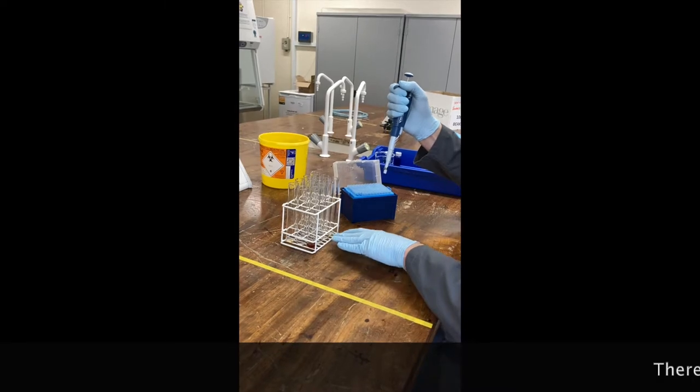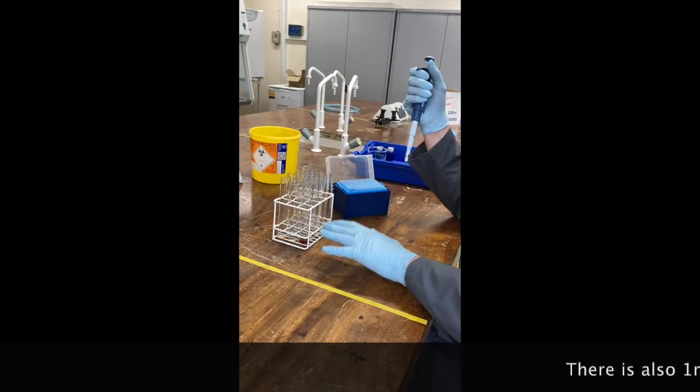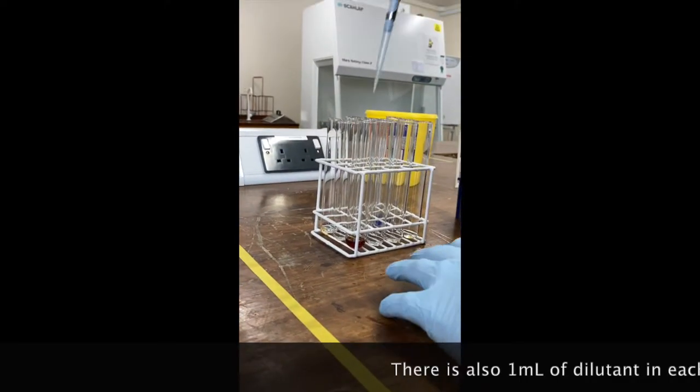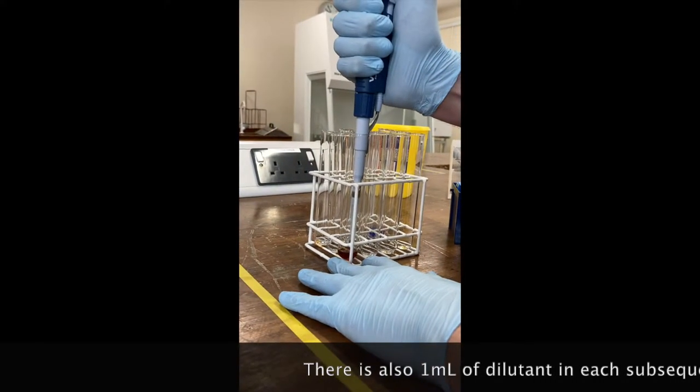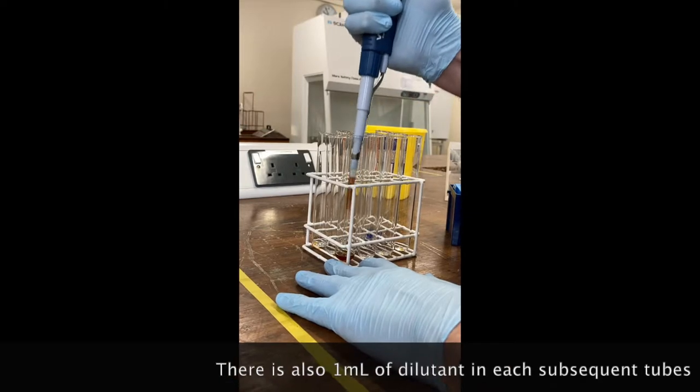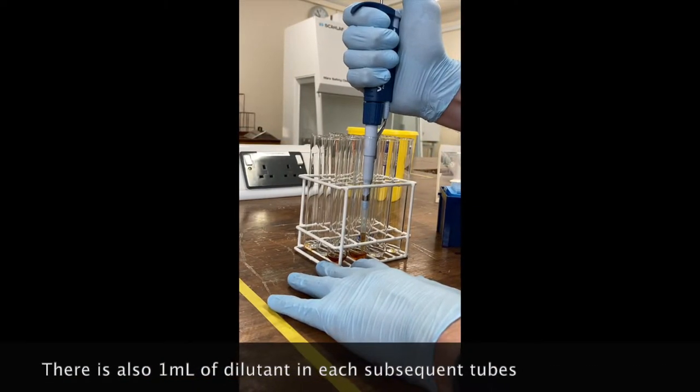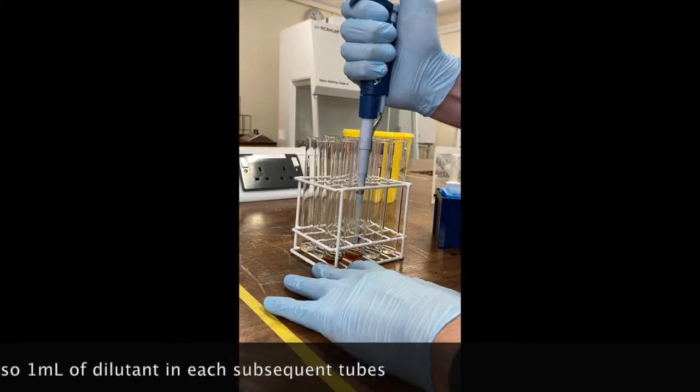and all I'm going to do is transfer one mil from the top standard down. Put the pipette on, go down, I'm going to take one mil up, making sure there's no air bubbles in the pipette. I'm just going to mix that by pipetting up and down gently into the second tube.